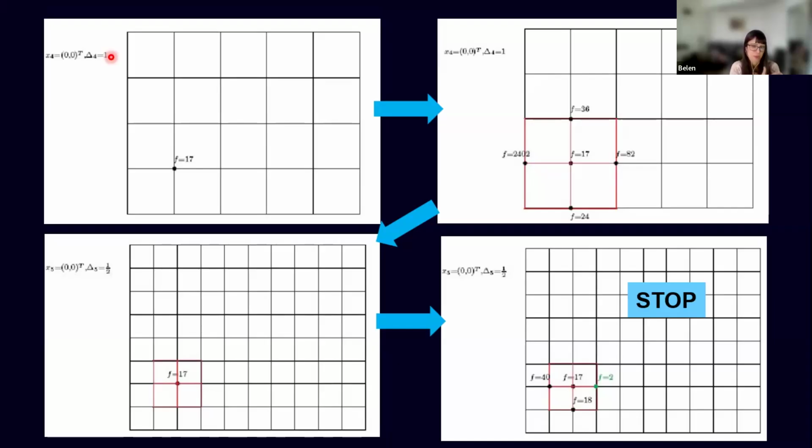If local minimizers coincide, we achieve a kind of practical globalization. This is exactly what happened to us using pattern search in our system. Of course, we also need to account for the noise and set tolerances carefully to guarantee convergence and robustness.